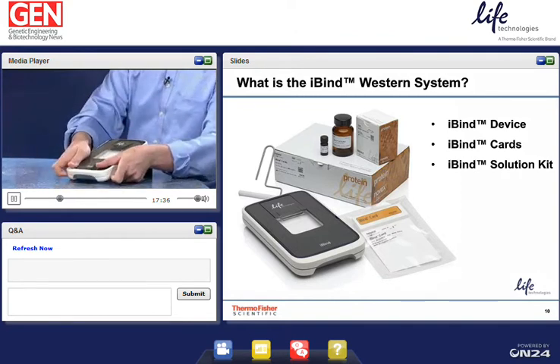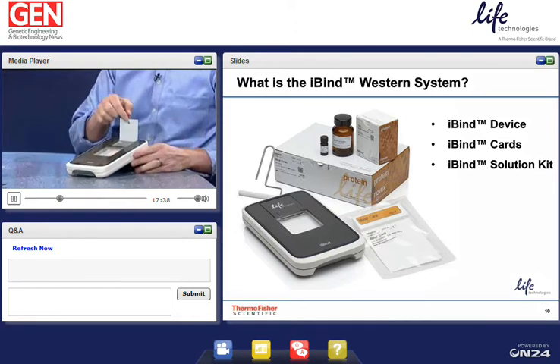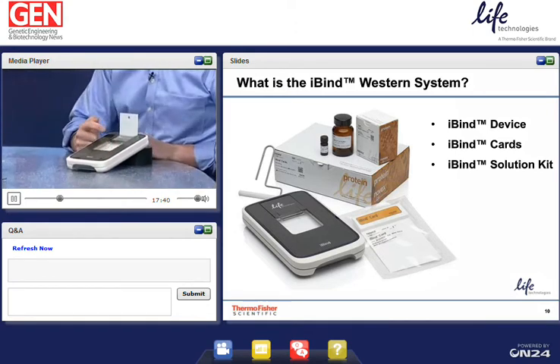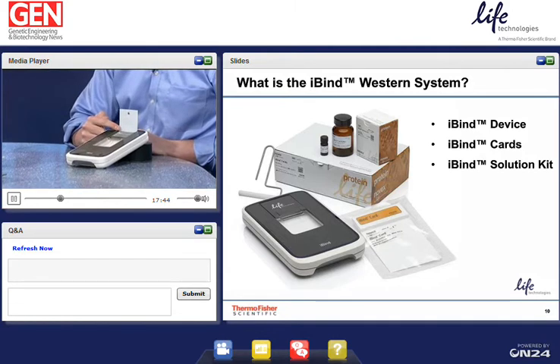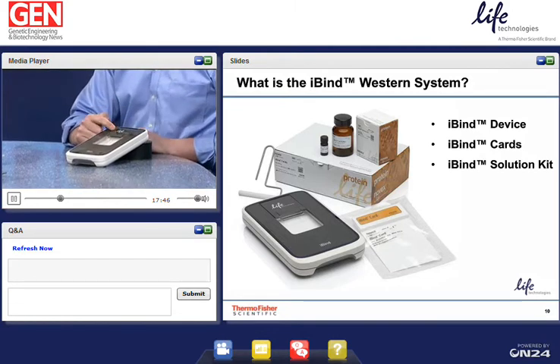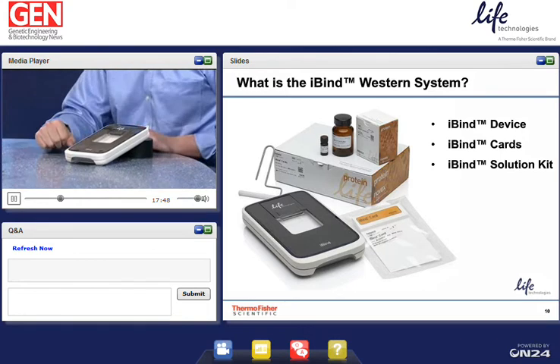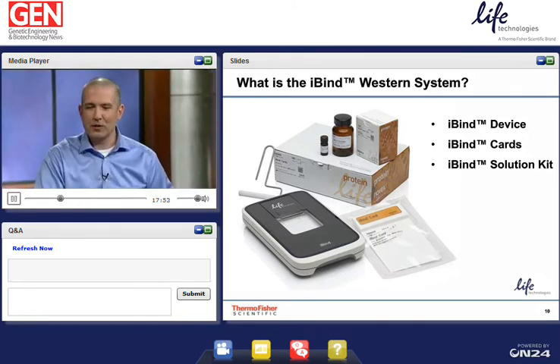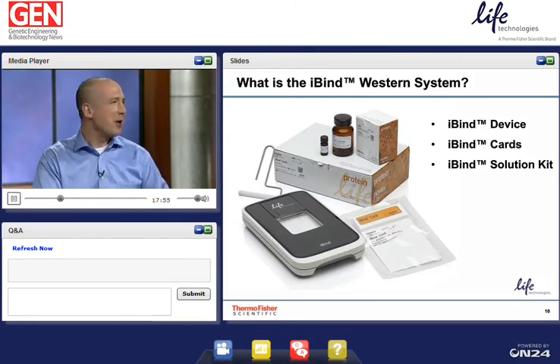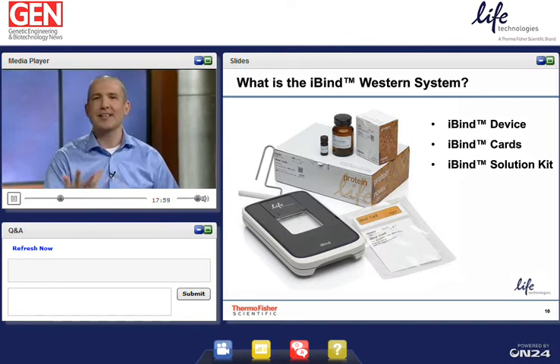You go ahead and close the lid, open this reagent cover, and add 2 mLs of primary, 2 mLs of wash, 2 mLs of secondary, 6 mLs of wash, close the cover, and walk away. And this is one of those things we joke about in the lab. I think there's a famous infomercial, hopefully it's not a trademarked comment, when they said set it and forget it. It sounds a little cheesy, but it is that simple.